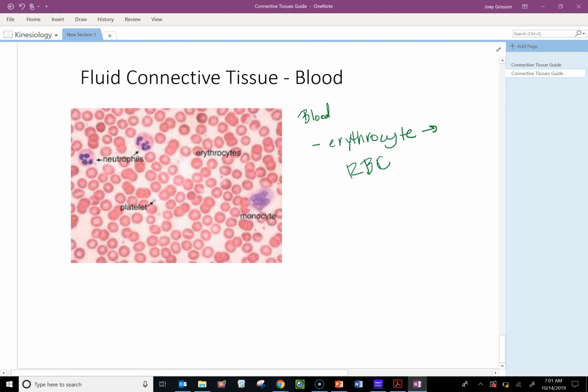Okay, so with the red blood cell, remember its structure is a little bit like this, sort of like a weird donut, because the nucleus in here is gone. So that's how we identify this as a red blood cell. We look at the images over here, you see that the cell is round and there's this kind of clear spot in the middle. That's not a nucleus.